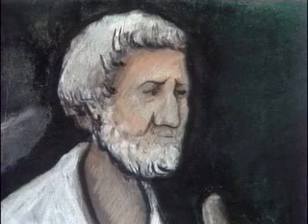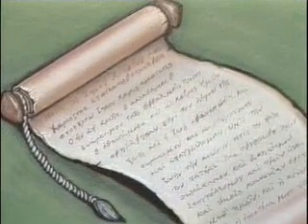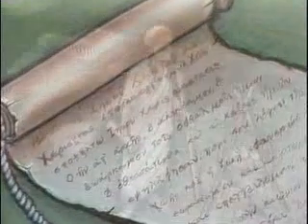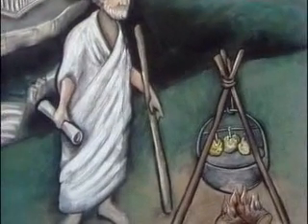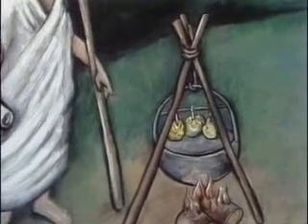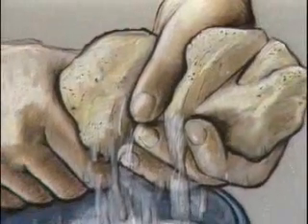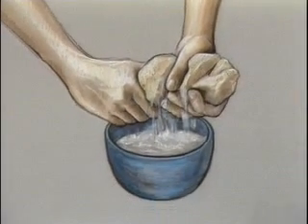Around 350 BC, the Greek philosopher Aristotle wrote about a process to distill fresh water from seawater. He found that hanging sponges over boiling seawater would collect the vapor of the steam. When these sponges were removed and wrung out, they yielded fresh water. This process is called distillation. Distillation is the separation of one substance from another based on the difference in boiling points between the two substances.